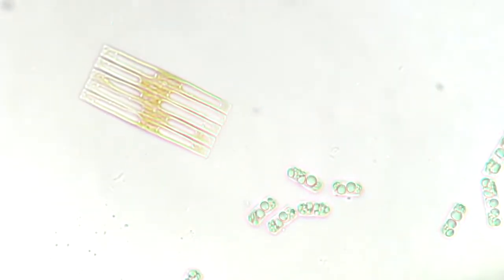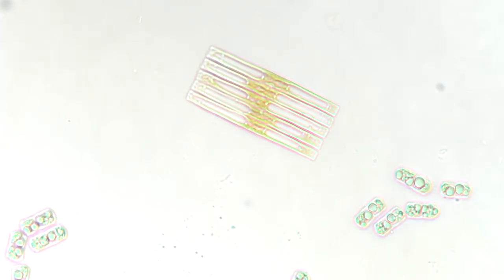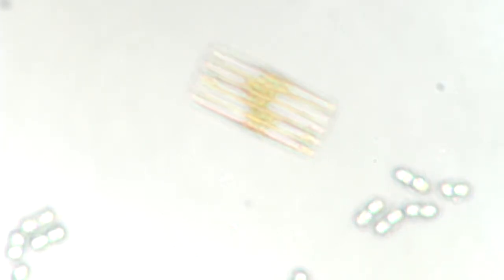What's this one? Died. Kind of died town. Fragilaria, yes.